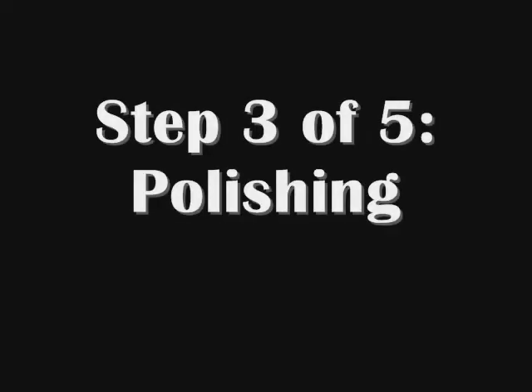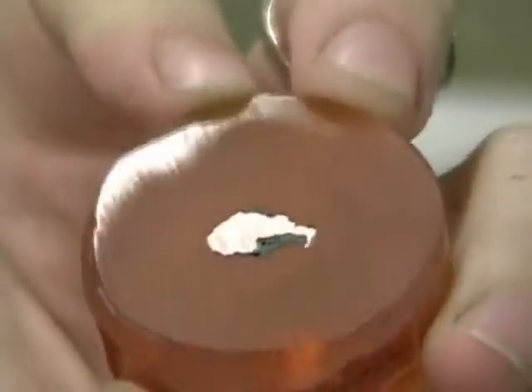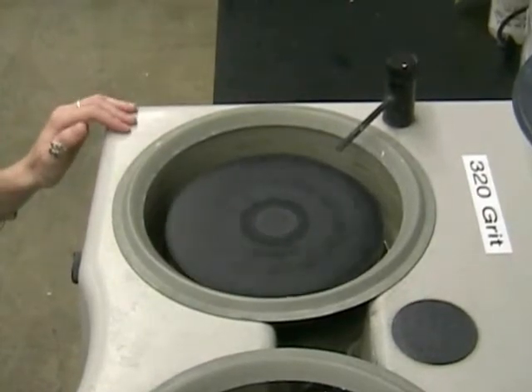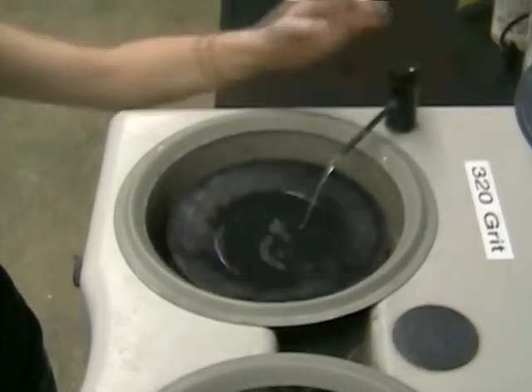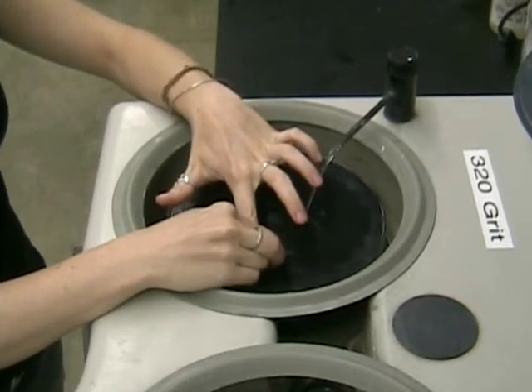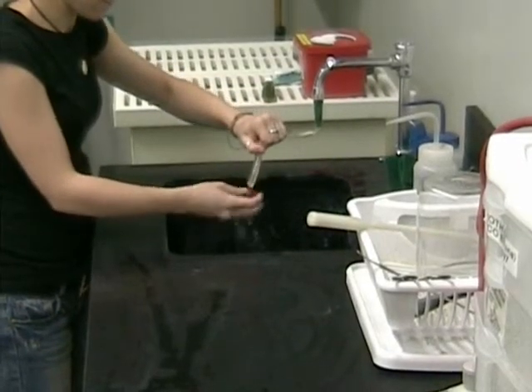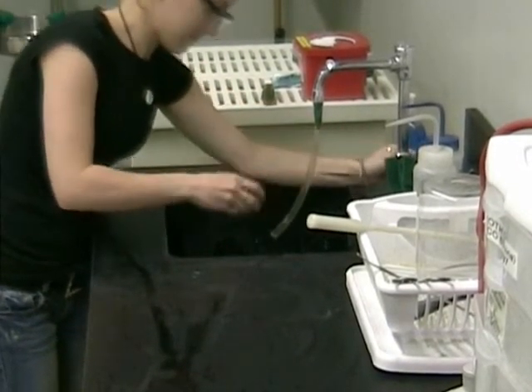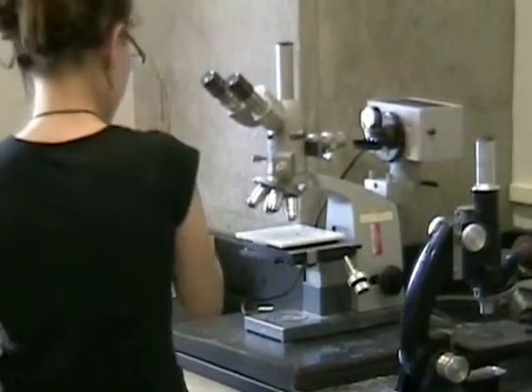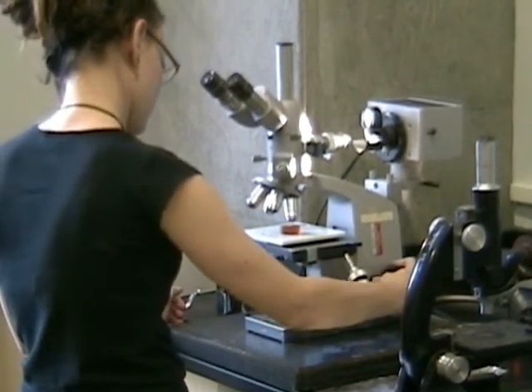Polishing a sample is done to get a smooth mirror finish. The basic idea is to start on a wheel with large particles and work down to smaller and smaller particle sizes. This native copper sample is particularly scratched and needs polishing. Start on the 320 grit, which is the coarsest. Put the water on so it doesn't heat up and place the sample on the wheel. Hold it on the wheel for about a minute or two, then always rinse the sample between each wheel and check under the microscope to see that all the scratches are uniform.